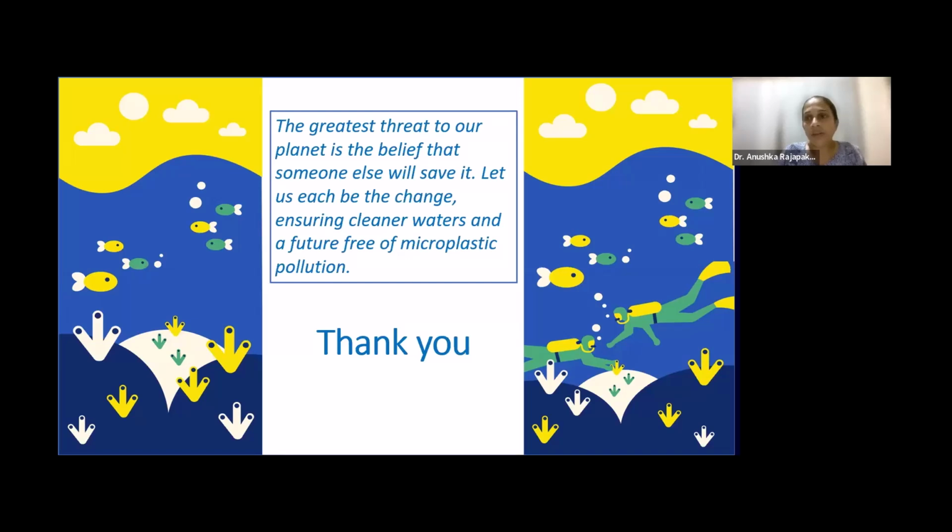Okay, question from Ishani. When it comes to soil media, soil particles attached to microplastics, she's having a problem getting absorbance peaks in FTIR due to the interference of soil. So normally, when analyzing the soil particles, first the density separation is done, then the organic matter is digested, then the bound particles can be separated.